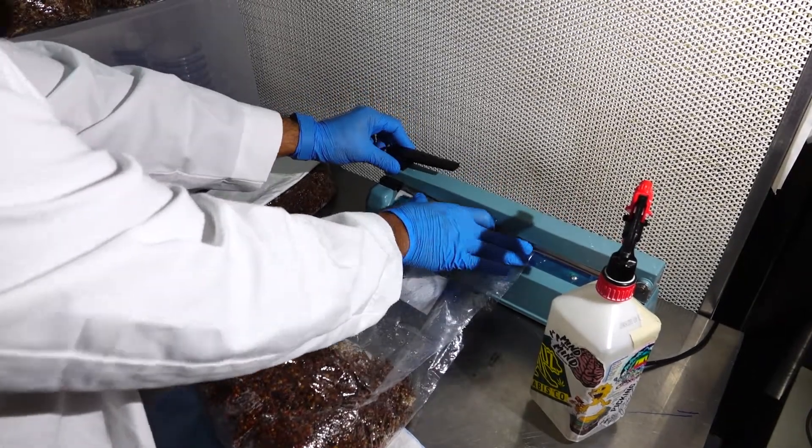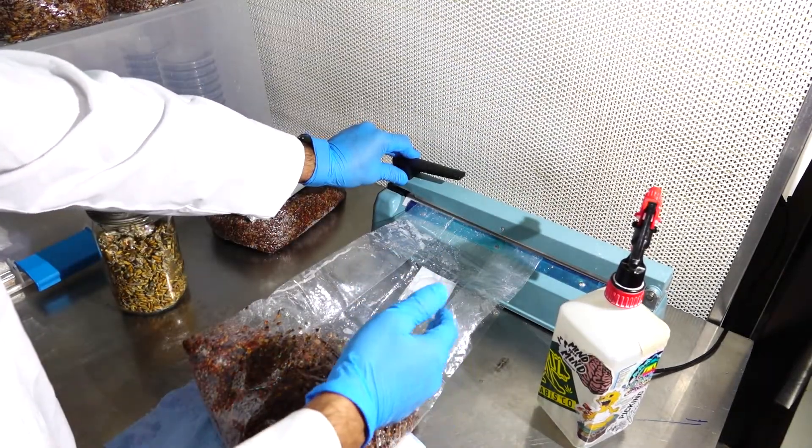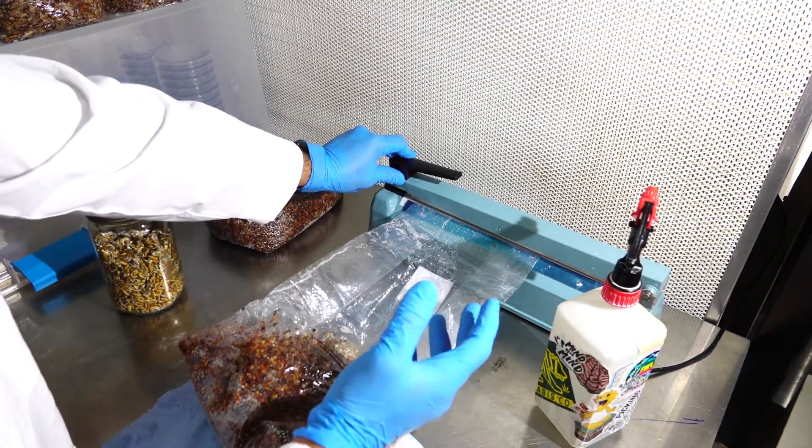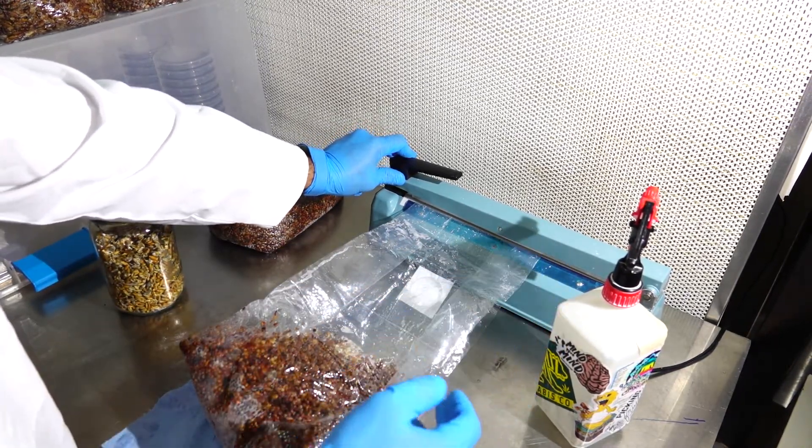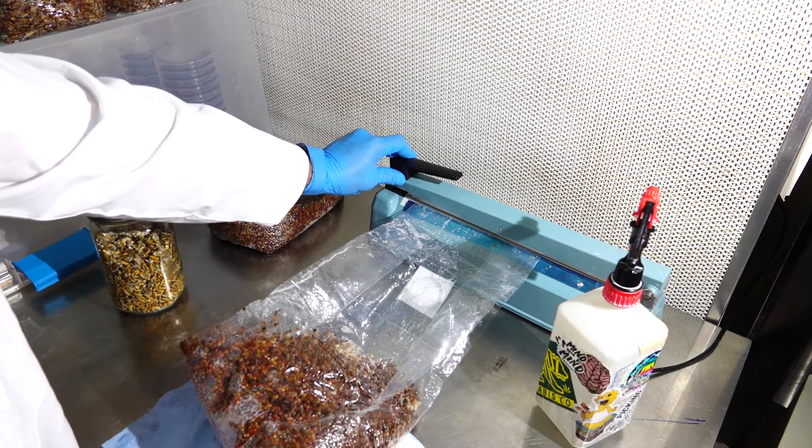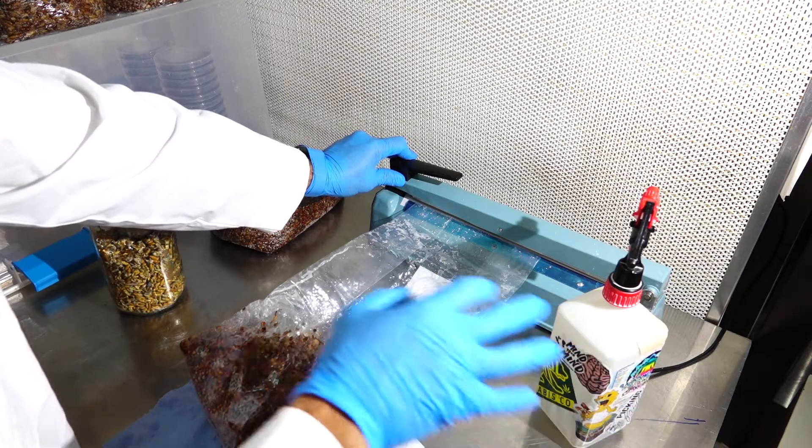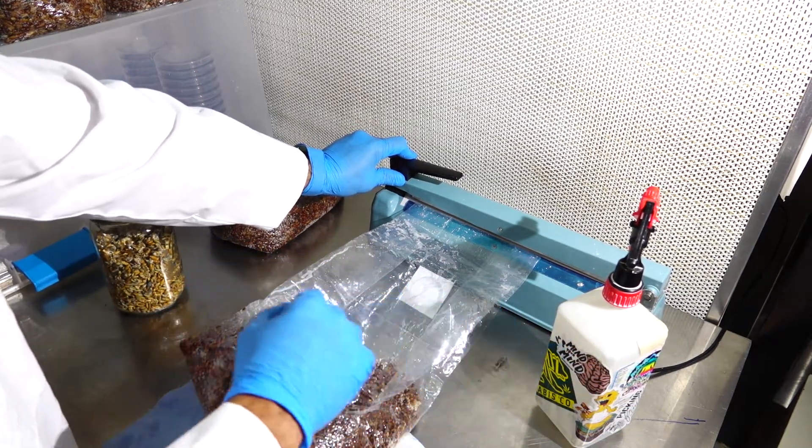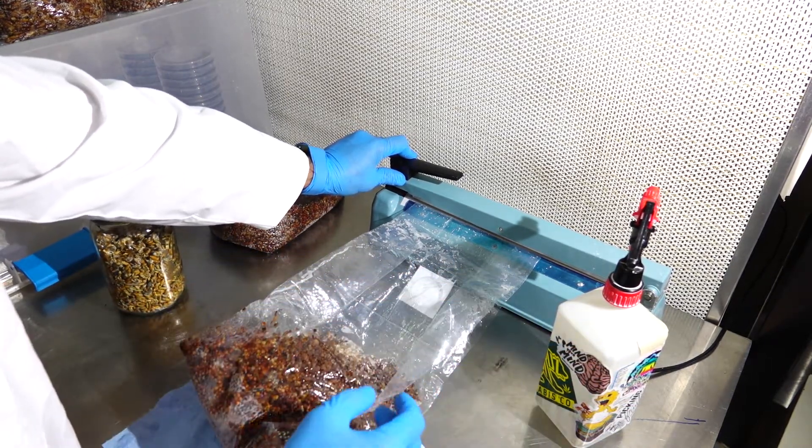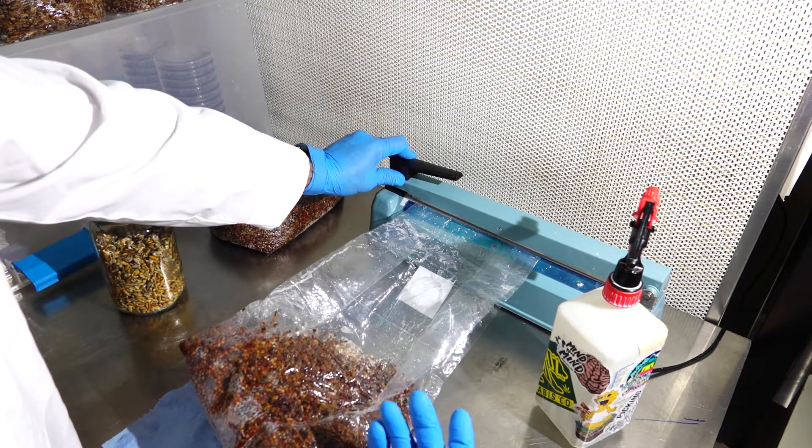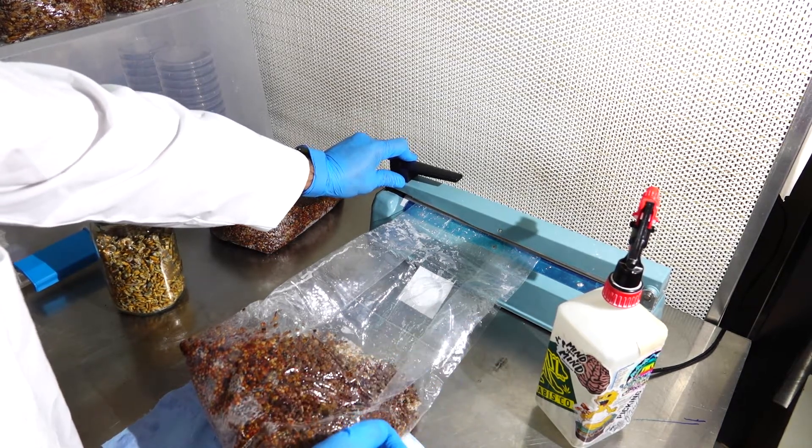Now if you don't have access to a flow hood and an impulse sealer, you can try to do this in a freshly sanitized bathroom or a very small space with no open windows and no air flow coming into the room. You also want to make sure that you bleach everything down, isopropyl everything down, clean all surfaces, clean your hands. You can also do this naked if you're afraid of having lint or animal dander end up on your freshly sterilized grains.